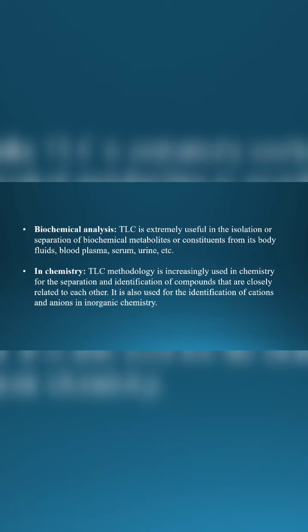In chemistry, TLC methodology is increasingly used for the separation and identification of compounds that are closely related to each other. It is also used for the identification of cations and anions in inorganic chemistry.